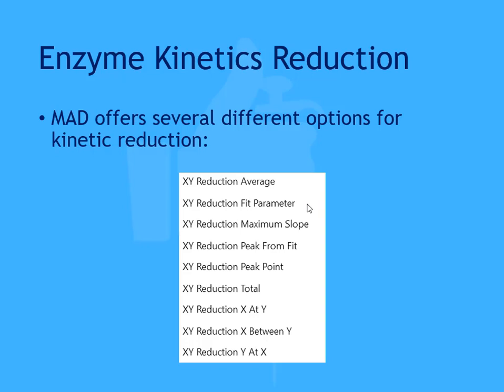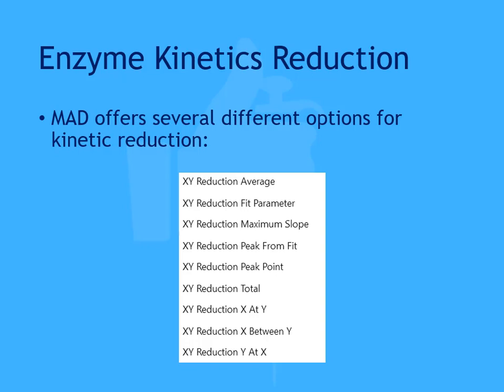The XY reduction fit parameter will perform a specified curve fit on each XY plot and will show the specified parameter as the result. For example, you could use a linear regression fit method and report the M parameter to report the calculated slope. The XY reduction total transform calculates the sum of all y values for each XY plot. Any of these transforms can be used to create endpoint data that can then be used in further calculations. The most commonly used for enzyme kinetics are slope and total, but if you're unsure which to use, you can easily try different methods.